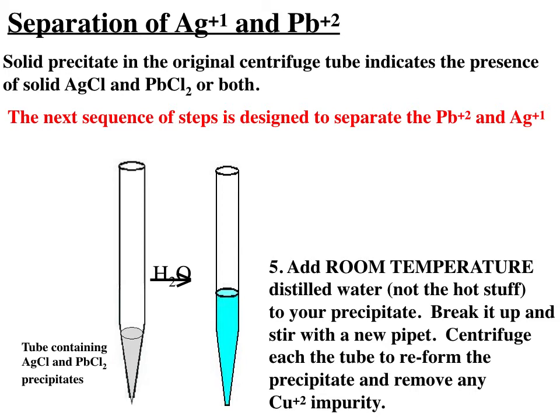So the copper, when we wash our precipitate, should be in the supernatant above that when we reprecipitate. Now, if you're trying to be really careful, you should probably wash and centrifuge several times to try to get all copper contaminant out of your precipitate.